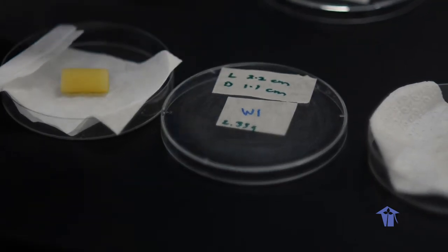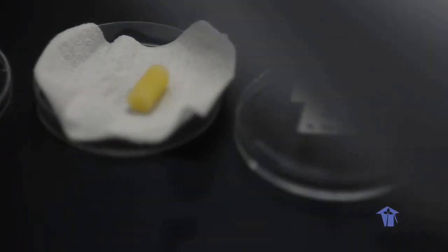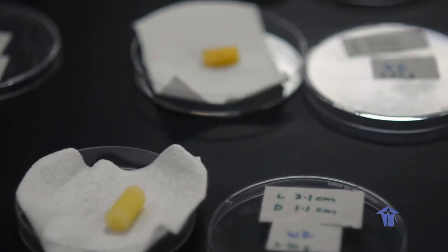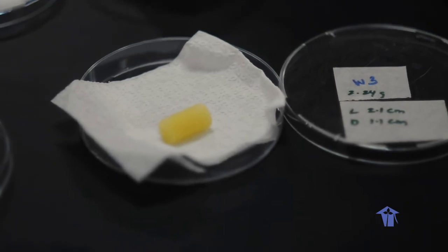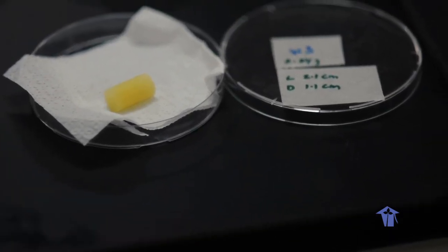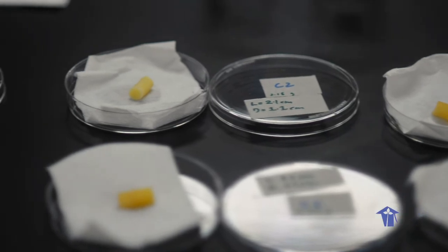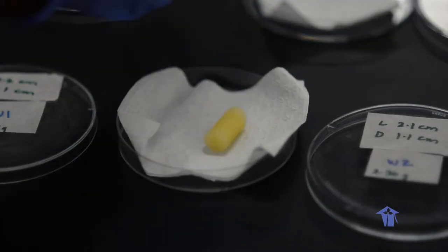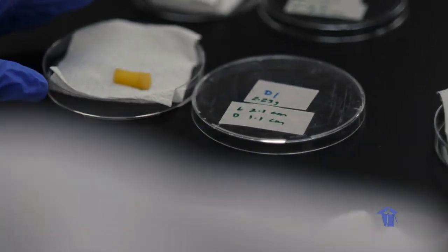These are the original dimensions, and we are going to show shortly a table in which the measurements have been compiled. But for now, you want to look at the differences between the potato strips that had been placed in the various solutions. The ones which had been placed in the dilute solution appear to be the largest, and at the top row we can see that the strips which were placed in the concentrated salt solution appear to have become a little bit smaller in size than they were originally. The strips in the middle seem to have stayed approximately the same size, but we can tell the difference when we do our calculations using the data that has been written on this sheet of paper.